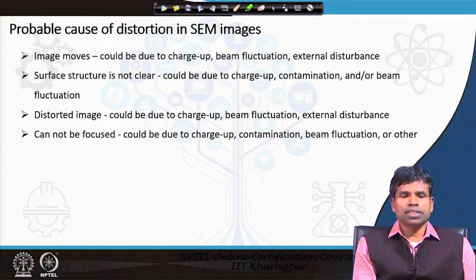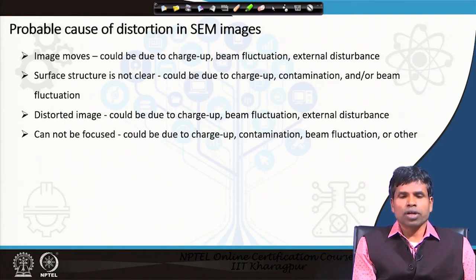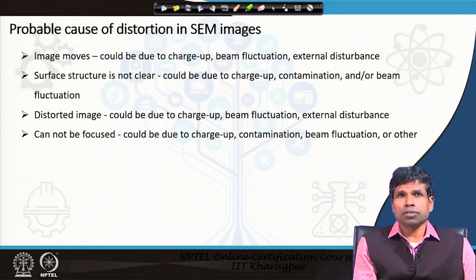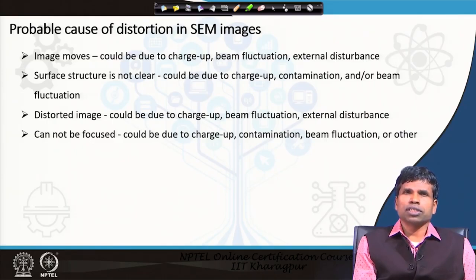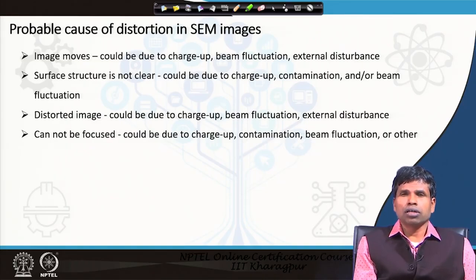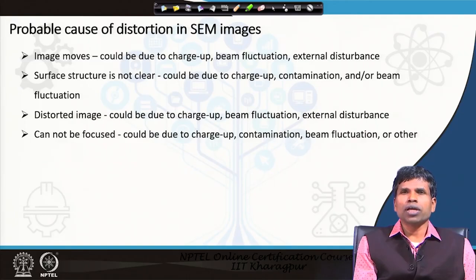Before showing a good SEM image, let us see the probable causes which prevent us from getting one. The first problem is that the image may move — you can find a discontinuous image because when an image moves you see distortion. This could be due to charging up, which happens when the sample is insulating. Additionally, the image can move if the electron beam fluctuates, or due to external disturbances such as magnetic field, mechanical vibration, or noise.